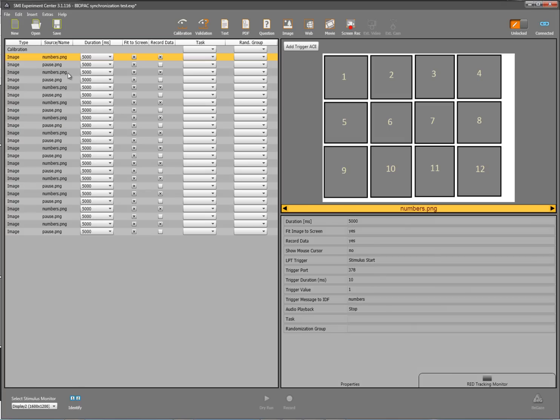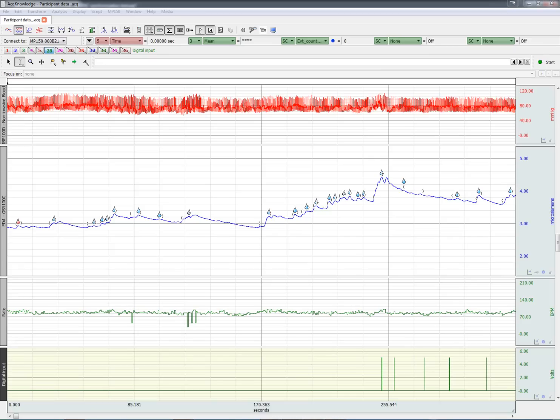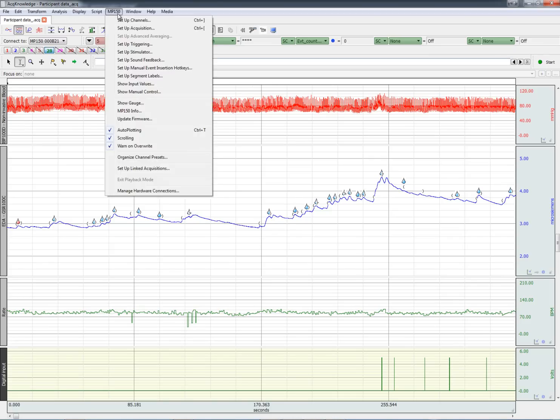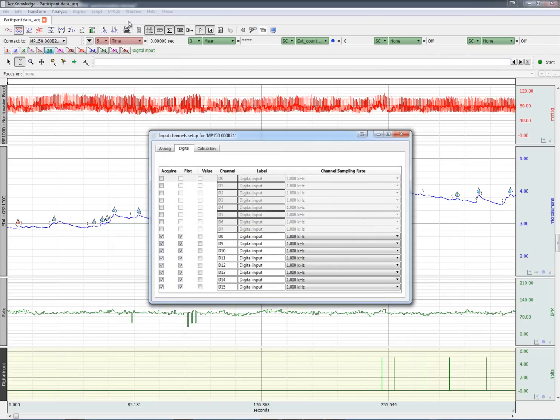In SMI experiment center, make sure to send a trigger via the parallel port at the beginning of the experiment. To record these triggers in AcqKnowledge, enable all the digital channels. Go to setup channels, 8 through 15 should be selected.